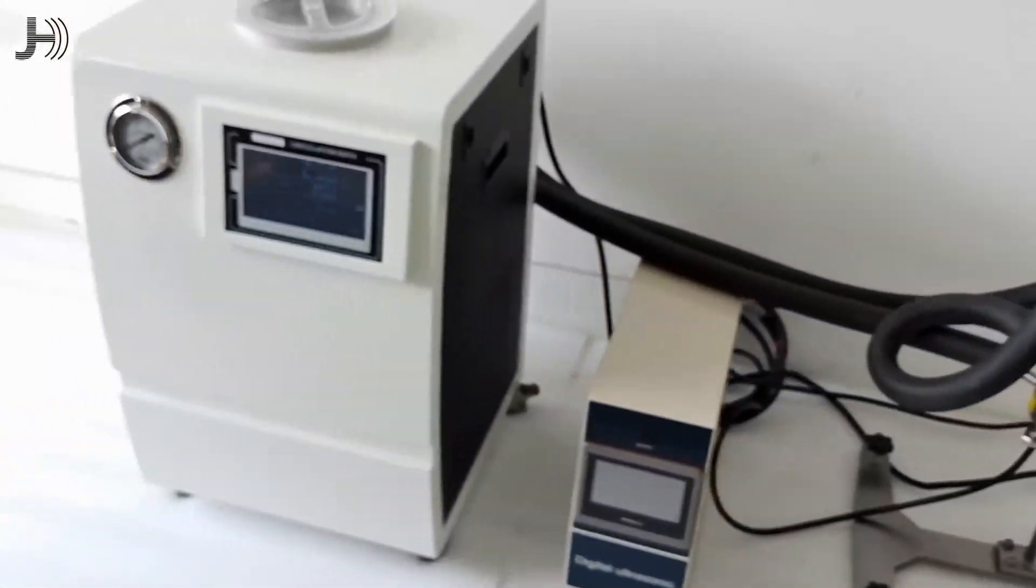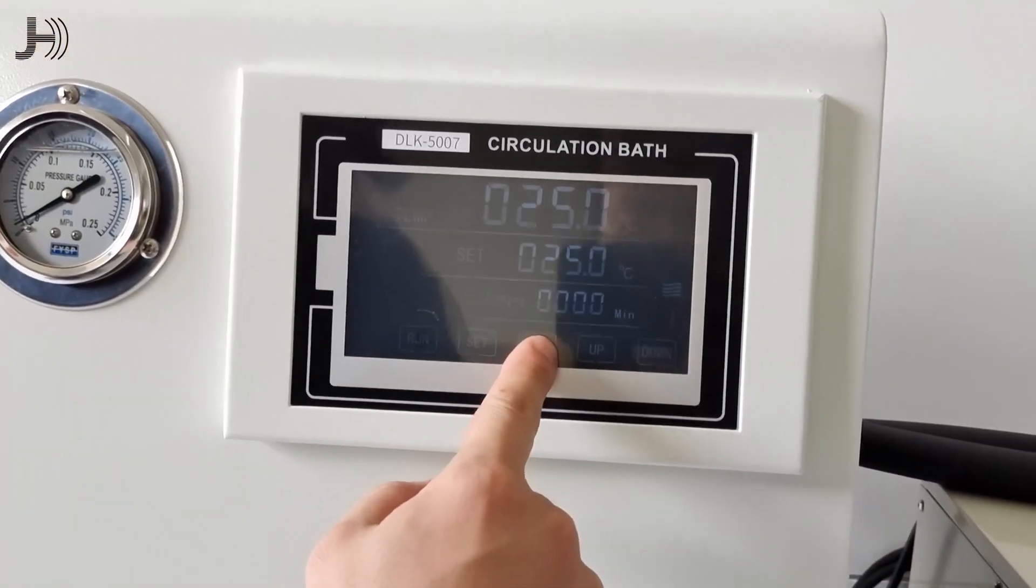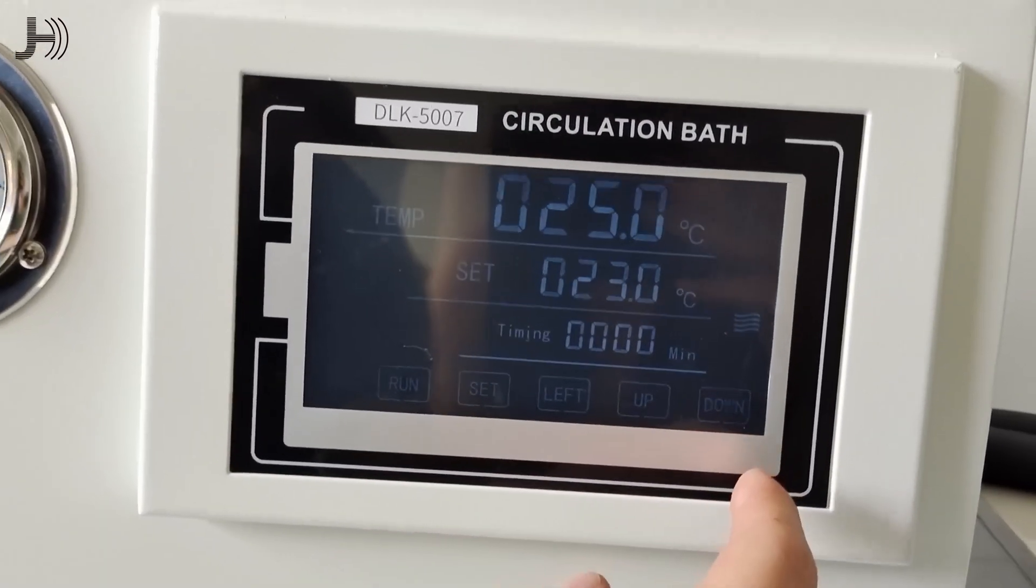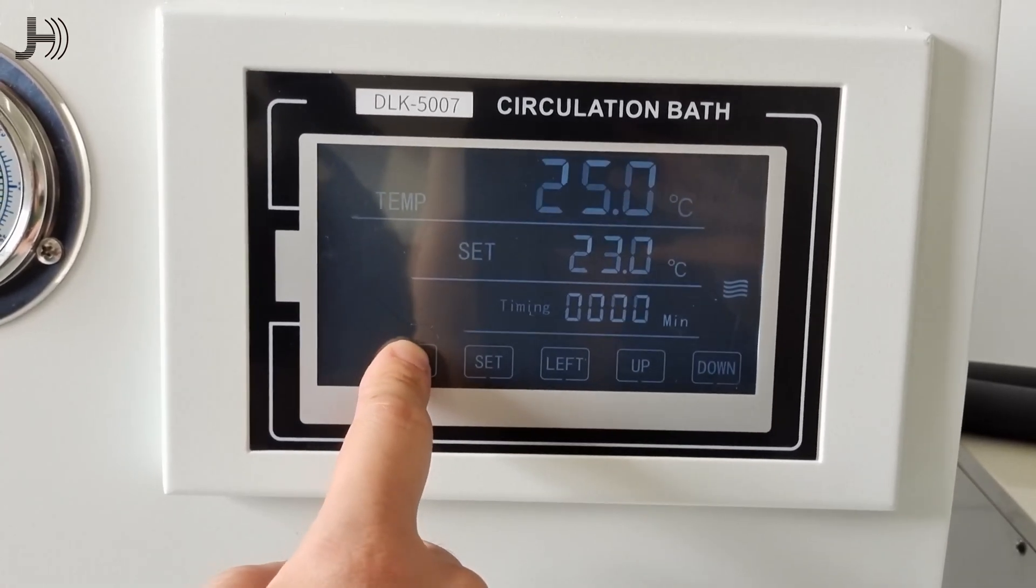Let's turn on the chiller. This chiller can control the liquid's temperature and the temperature can be set. Run it.